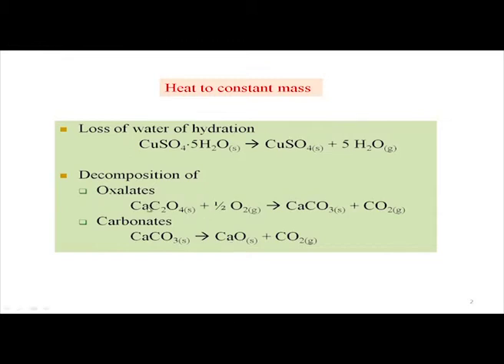So, here we see that starting from your hydrated salt, this is hydrated. So, calcium oxalate is also a hydrated one, which we just now have seen is a monohydrate. That monohydrate will give rise to the corresponding anhydrous form of calcium oxalate. Then that particular calcium oxalate can break down, in presence of plenty of oxygen, because if oxygen supply is there, the other gaseous product which is coming out from this thermal degradation is carbon dioxide.